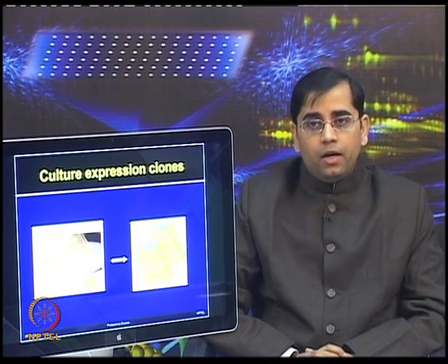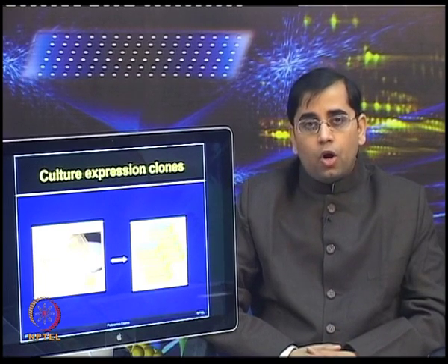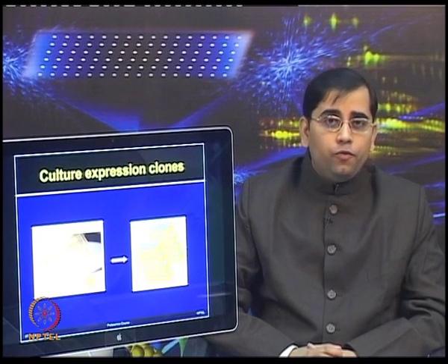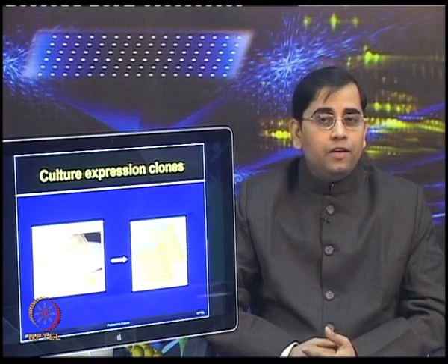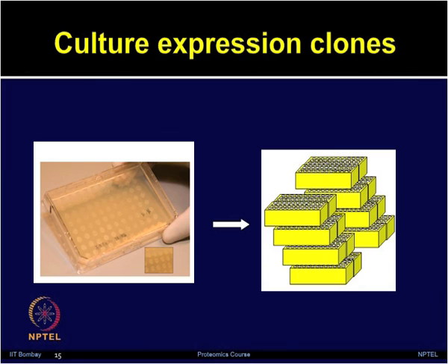The DNA preparation process is very similar to what everybody performs in a regular molecular biology lab. The only difference here is that the steps have to be automated and in a more high throughput manner, because if you are working in tubes, doing 5 or 10 genes, you cannot achieve the 20,000 density. So, all these steps need to be automated.